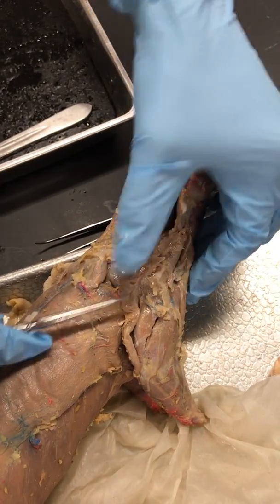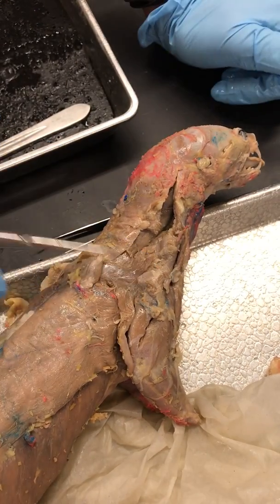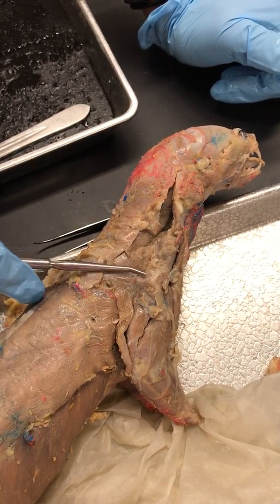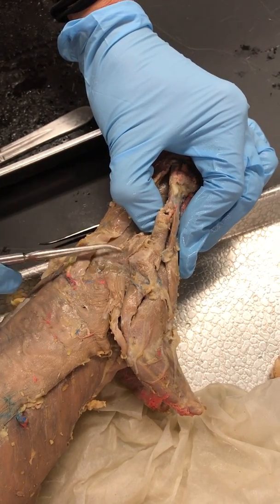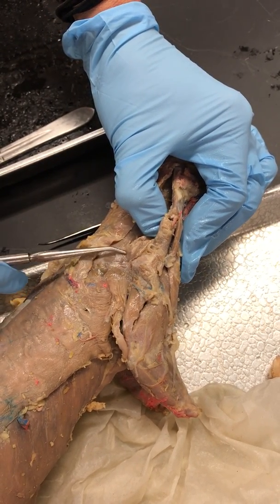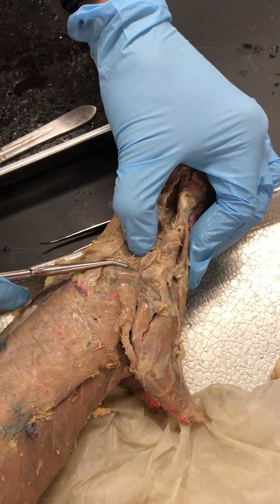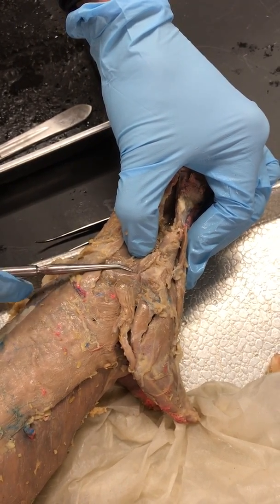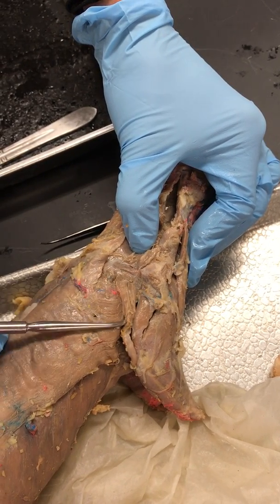We can also go back here and see Infraspinatus. Infraspinatus is going to sit under the spine of the scapula — you can feel the spine of the scapula right about there. Infraspinatus is relatively small but it's right there, under the spine. That's Infraspinatus, right at the top of Dorsal Epitrochlearis.